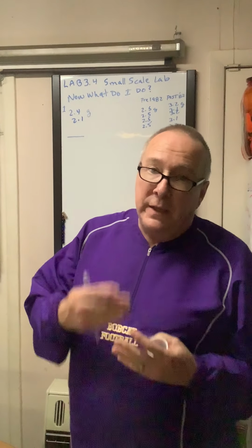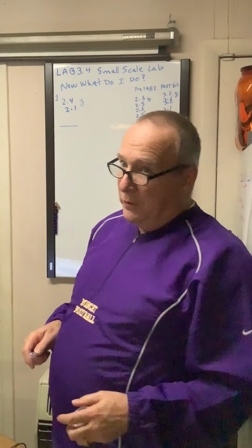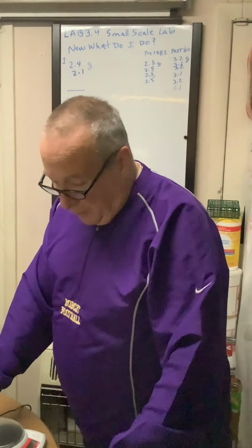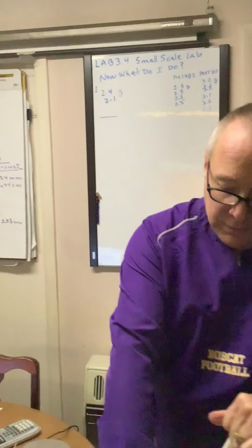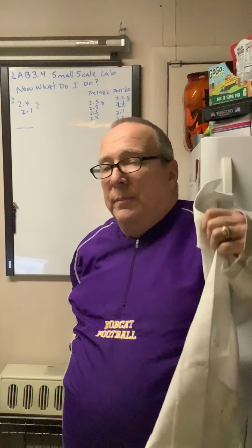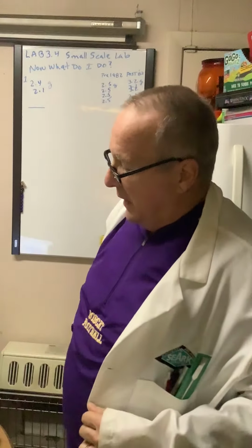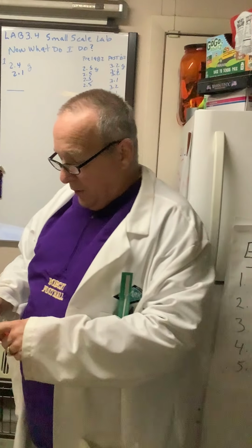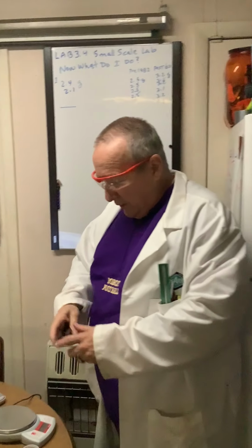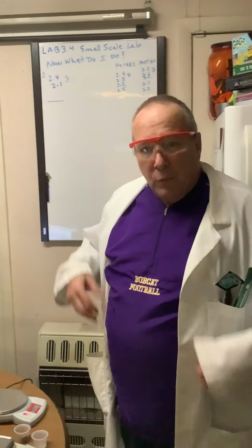And ideally, if we were face to face and able to do so, working with different laboratory equipment, which I'm going to introduce. So this one is one where we would go to the lab, don our safety equipment. I don't really need a lab coat for this, but it makes me look very professorial. And of course, you would all be wearing your safety glasses. And the first part of the procedure asks you to measure 50 drops of water.